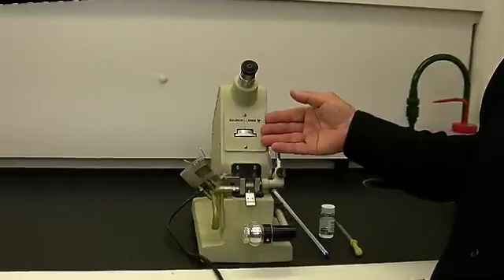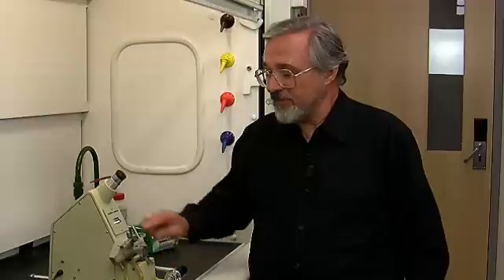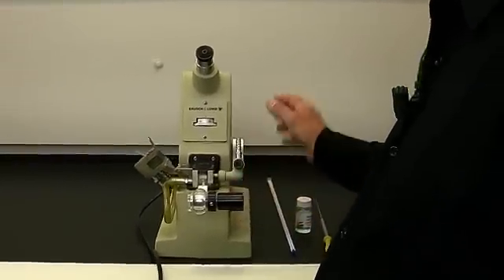The refractive index of a pure organic liquid is a very easy measurement to make. We're going to be using the Bausch and Lomb Abbe refractometer. There are several moving parts on the refractometer that we have to become accustomed to. The first are a pair of prisms and we have a lamp. On the right side of the refractometer is a dial which will become evident later on.